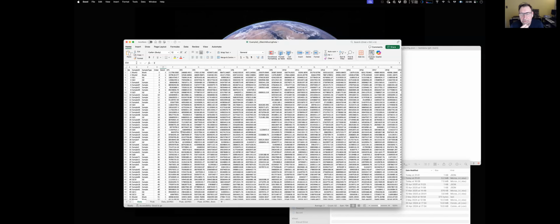Yeah, a lot of it depends. You saw the slide from Craig Wheelock where he did over 1,000, and I'll have to talk to him again about exactly how he did his QC. But I know one option is what you've just suggested. The other is to do a kind of a rolling QC.